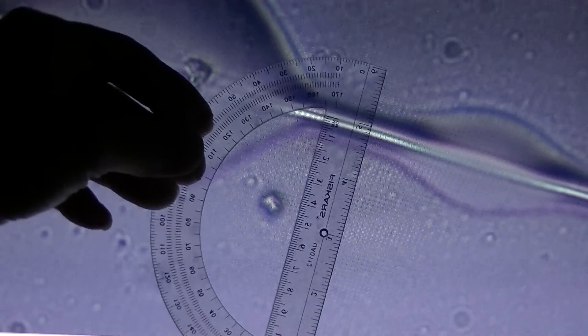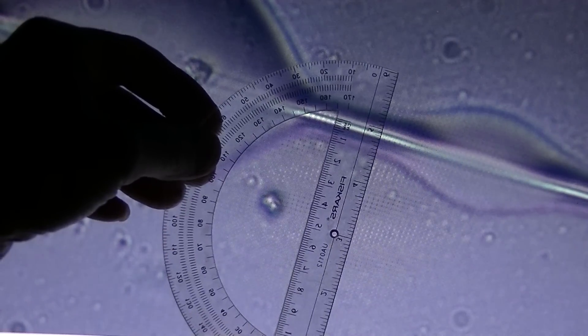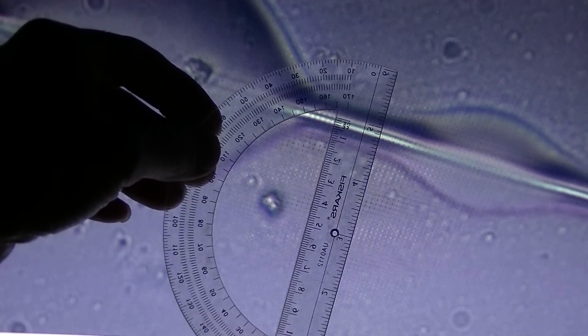So if we measure this one, it's about, I don't know, hard to tell, four millimeter.